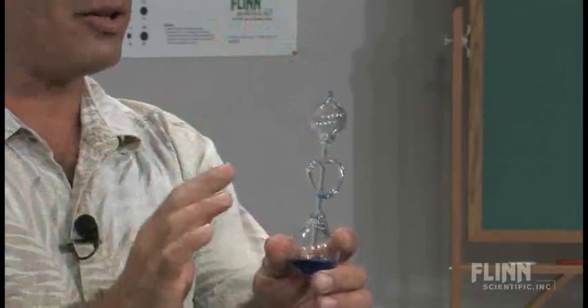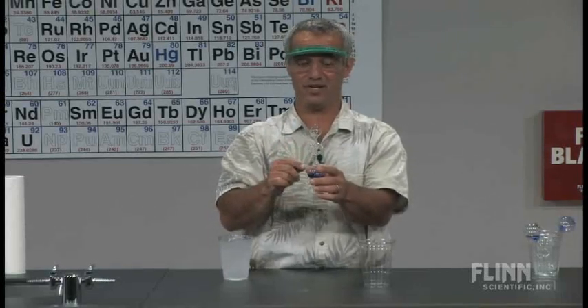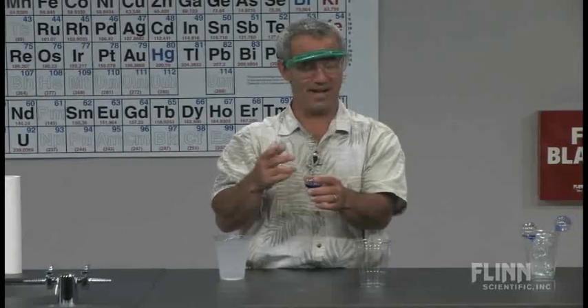But the demonstration I'm about to show you uses this piece of equipment in a very, very different way. And I have to give credit to my oldest daughter Jenna for this. She discovered it completely by accident.